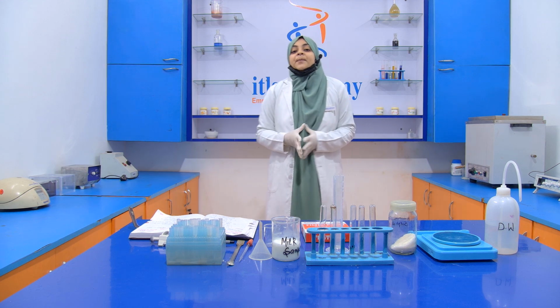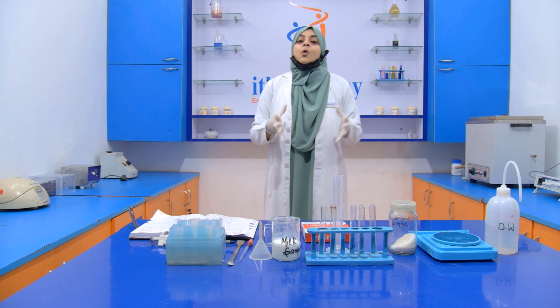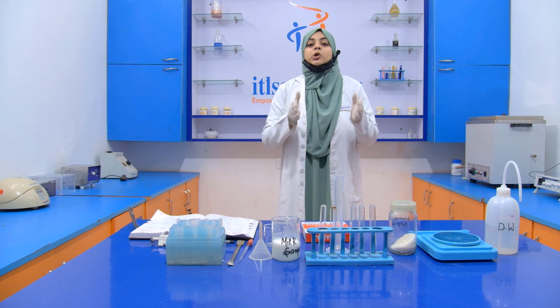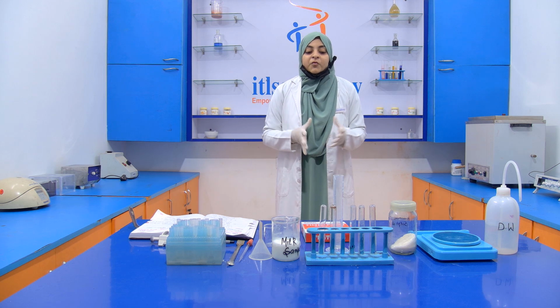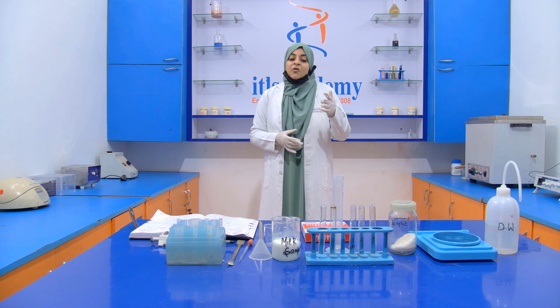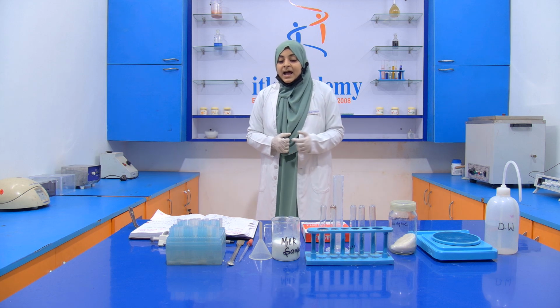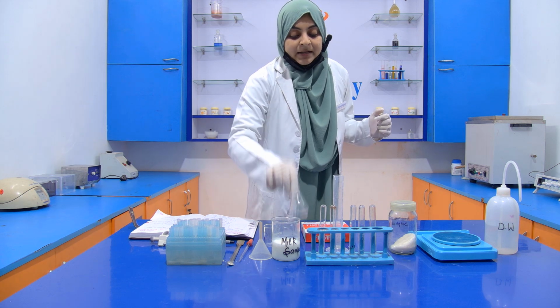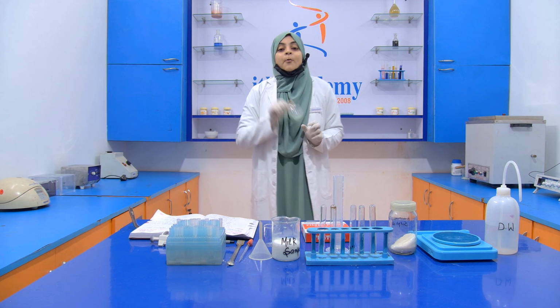Now, what is the procedure for performing this experiment? It is very simple. We take 20 ml of milk, and to the 20 ml we add 4 grams of this ammonium sulfate inside the conical flask, and we agitate that flask for 1 minute.